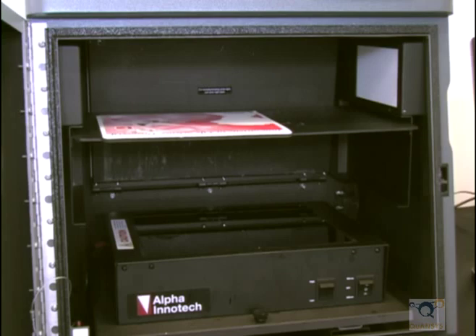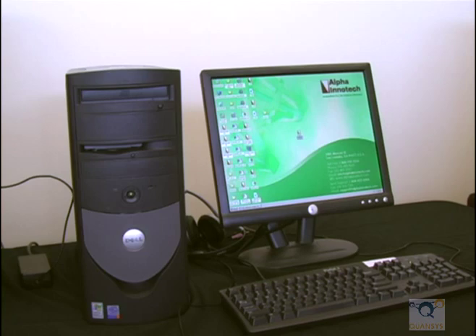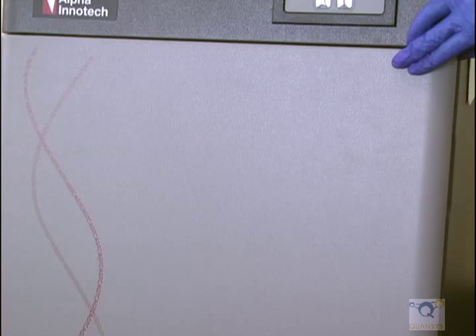Launch the software on the computer and then click the Acquire button. Close the door on the camera slightly so some light can get in and you can see the mousepad on the computer screen.